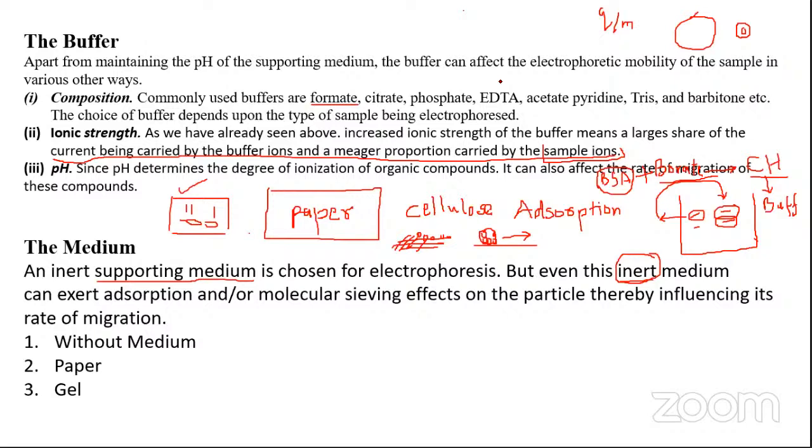Yes, so retardation to some extent, not to the extent that it doesn't even move properly and there is not a proper separation, but retardation to some extent is also necessary. We cannot let it fly. Some resistance is also necessary. If we decrease the resistance altogether, then we saw how there could be a problem with a lot of current being generated and also electrolyzed sample. Okay, that could be one point of concern, but there are certain other things that you will slowly understand.